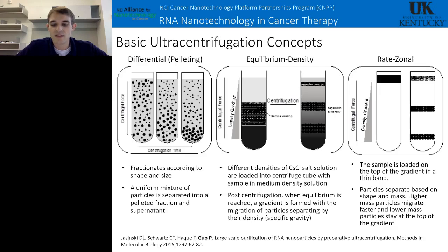And then the last one I will talk about is rate-zonal ultracentrifugation. This is kind of similar to the principle of a gel.